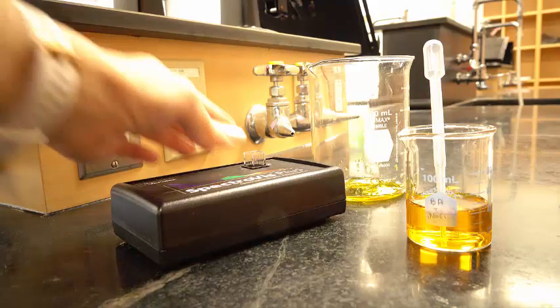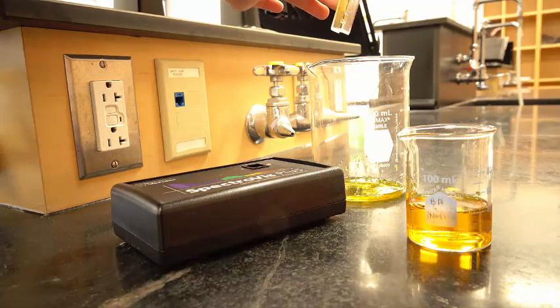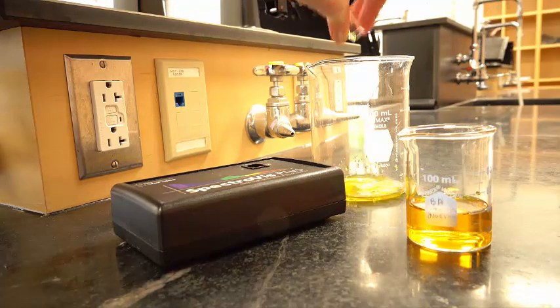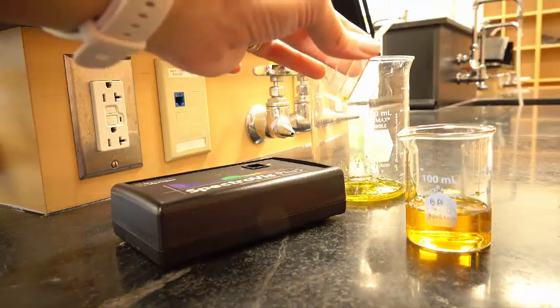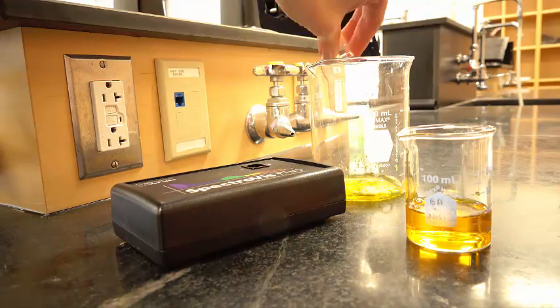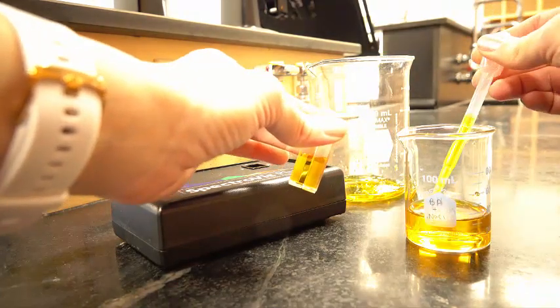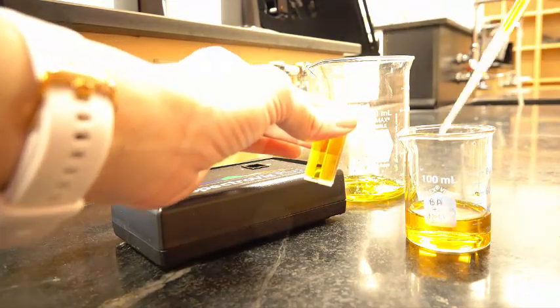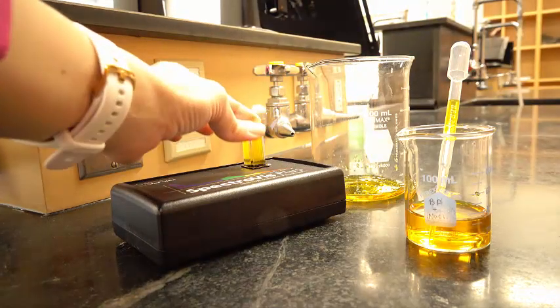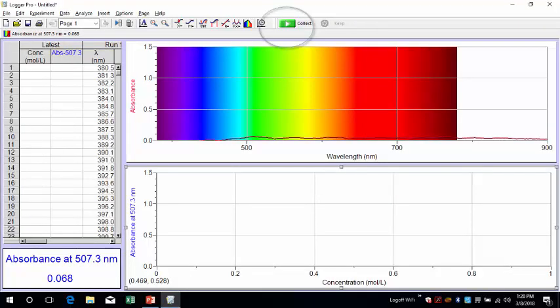Place a small amount of thiocyanate in your cuvette, swirl it, and dump it into your waste beaker. Repeat one more time. This is a way of cleaning something that will not be easy to dry. So now if there are any droplets inside your cuvette, they are of your beaker 2 solution, not your beaker 1 solution. After 2 rinses, fill your cuvette 3/4 of the way full with beaker 2 solution and place it in the spectrometer. Hit collect.